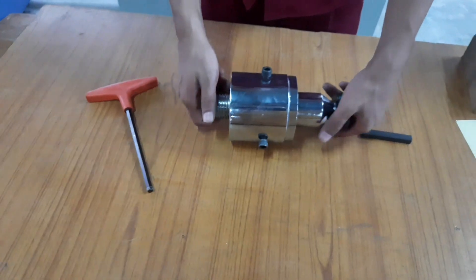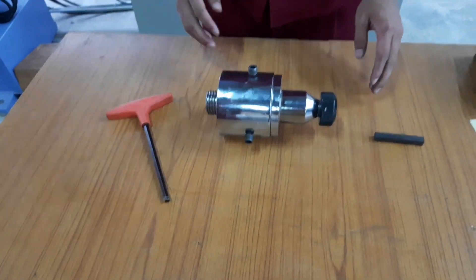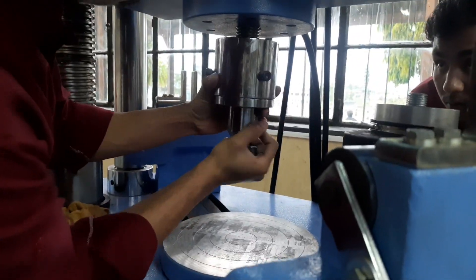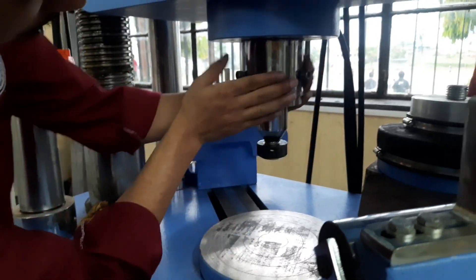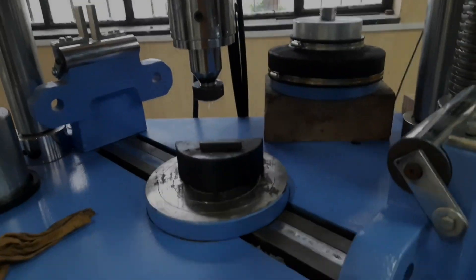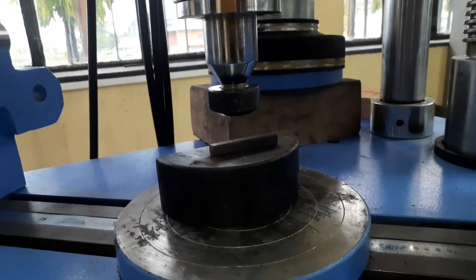After assembling it all together, the attachment is fixed to the slot provided in the bottom cross head of the UTM. After that, the test specimen is placed on the bottom platen. Then the distance between the two cross heads is maintained to a suited height of the specimen by the use of the controller in the UTM.